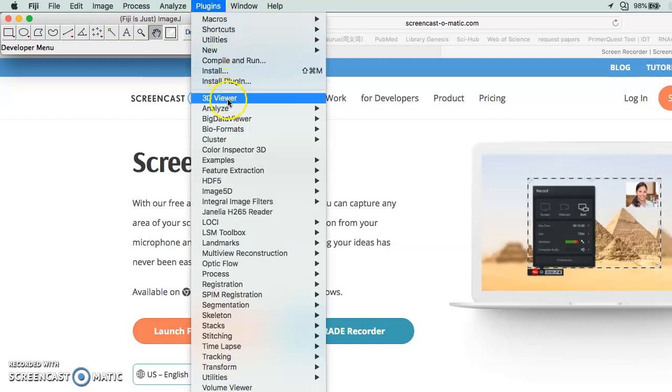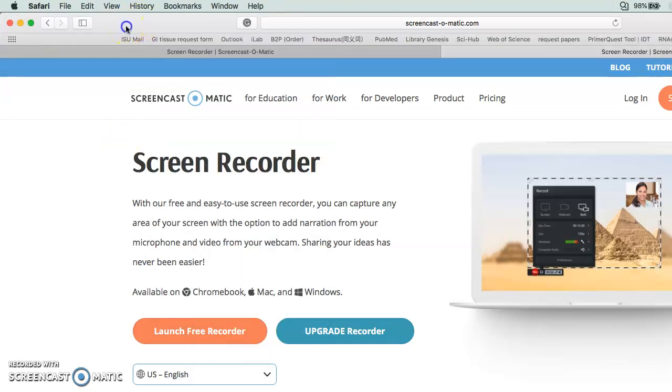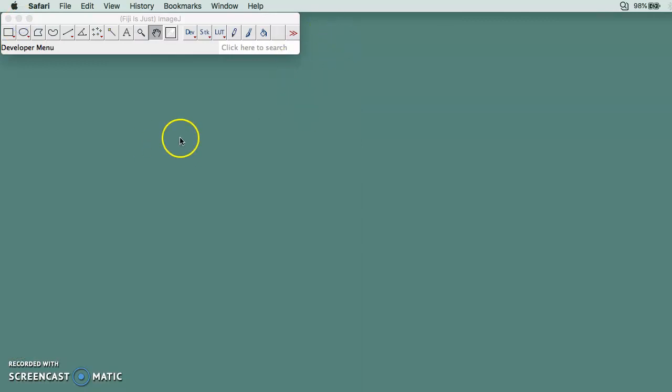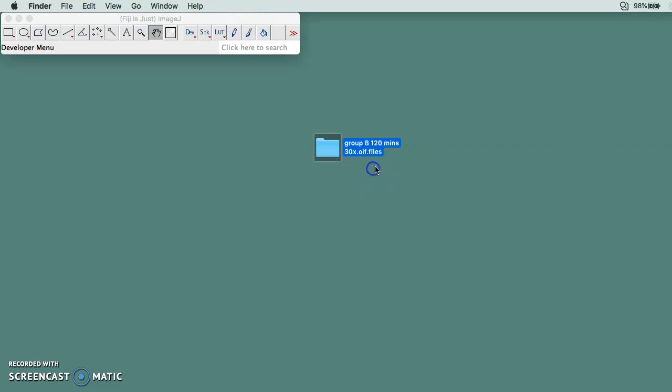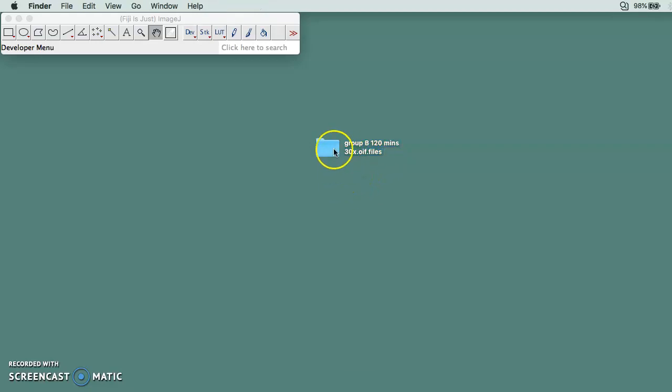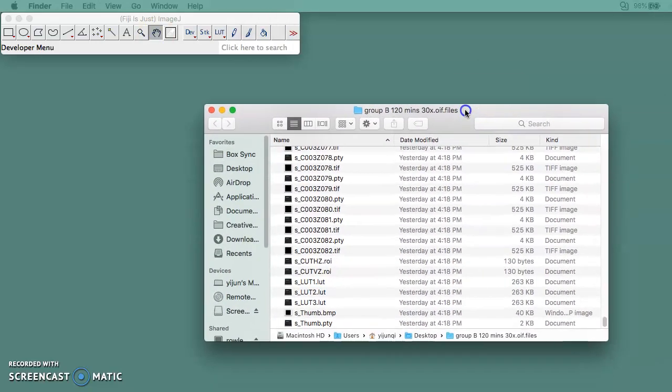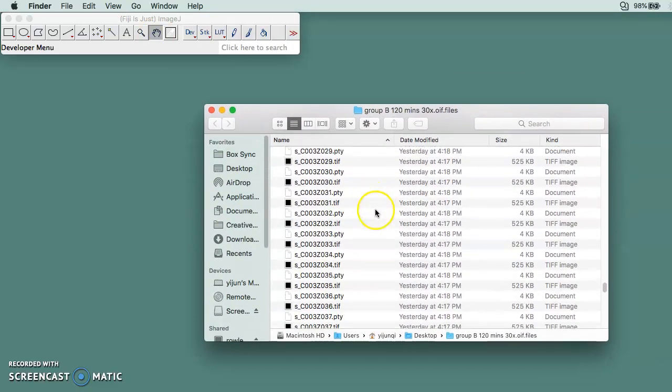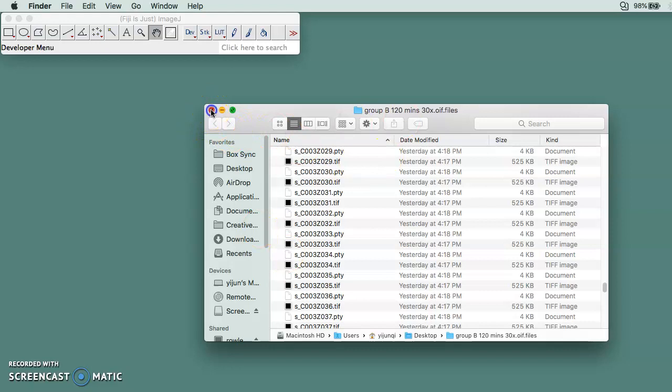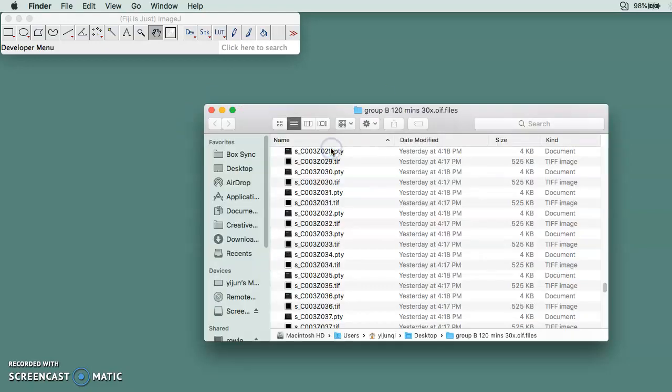First, after you get the file from the laser confocal microscope with your fluorescent image, you would see that there is actually a whole bunch of images. What you need to do first is open it.